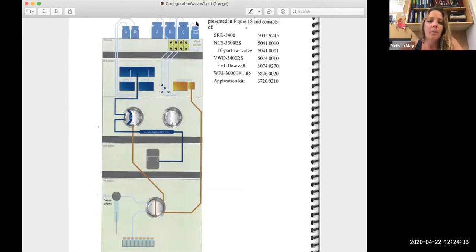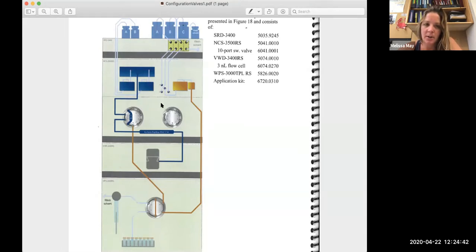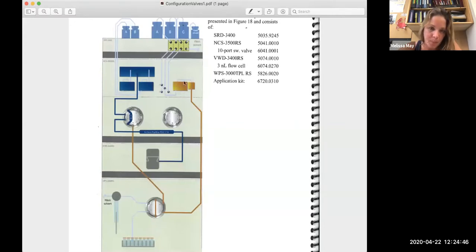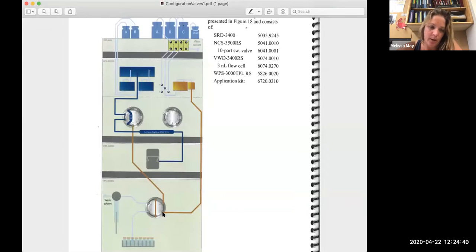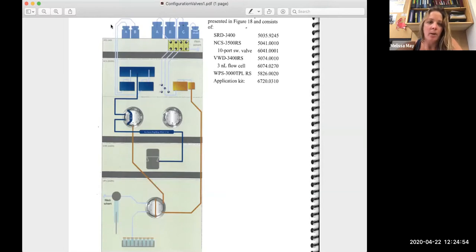So right here we have our solvent jars A, B, and C. These are our loading solvents. You can see that they come into the degasser, the lines come out, they feed into this loading pump block, and then go down into our autosampler.